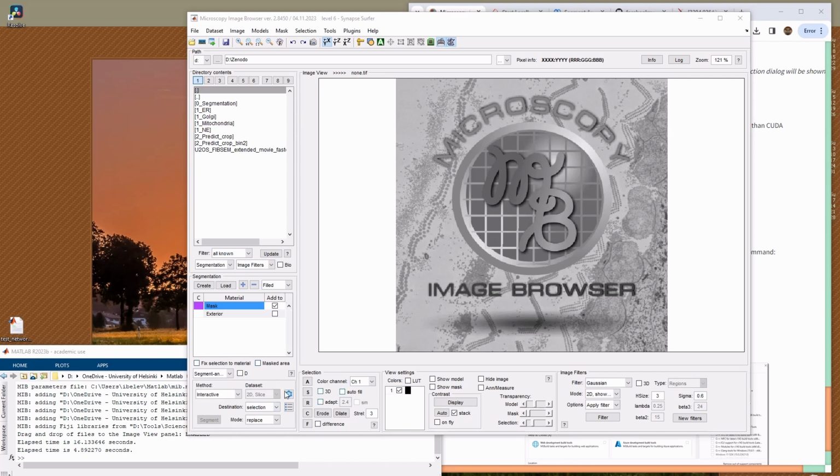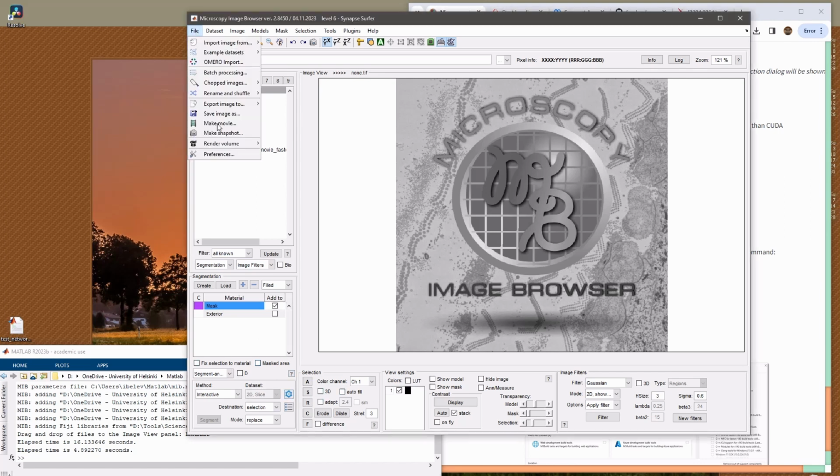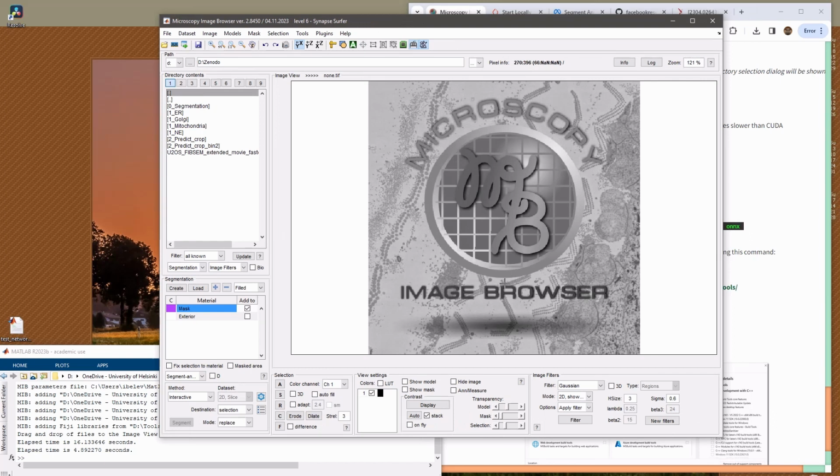And then actually I had to do it again and do the preferences to specify the path directories, because I wasn't able to close the Microscopy Image Browser before the installation. So if you go to that step, close MATLAB first.